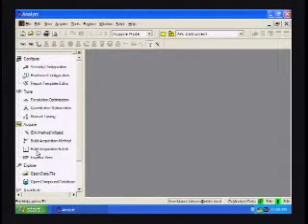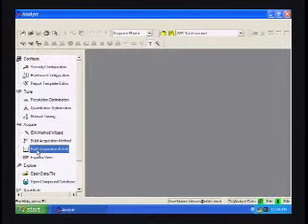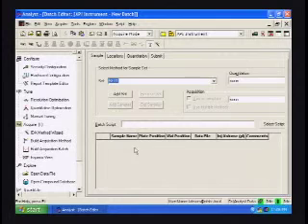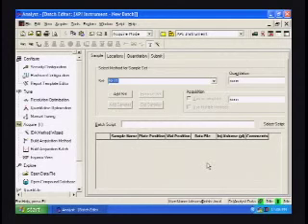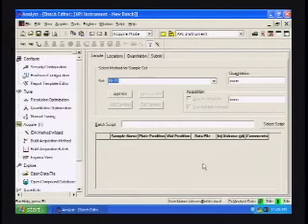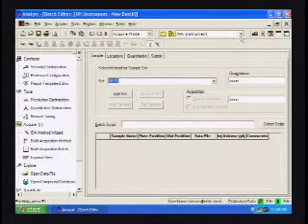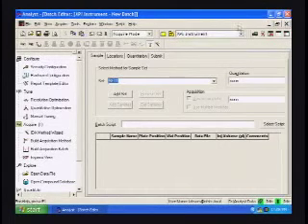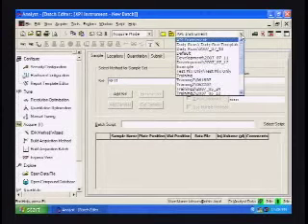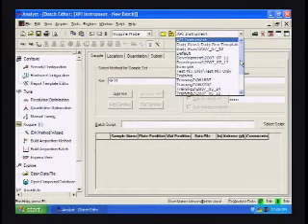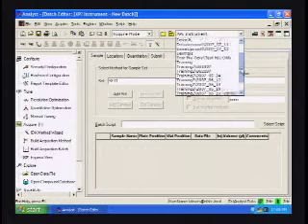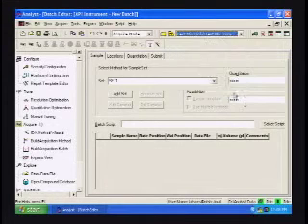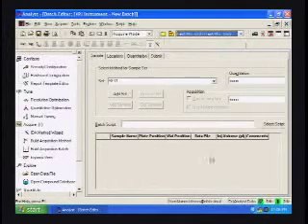So under the acquire icon, let's double click on the build acquisition batch. As we discussed earlier, an important feature is to make sure that you're in the right project folder. We don't want to put any type of data into the API instrument project folder. So let's choose test mix only, this particular project folder.